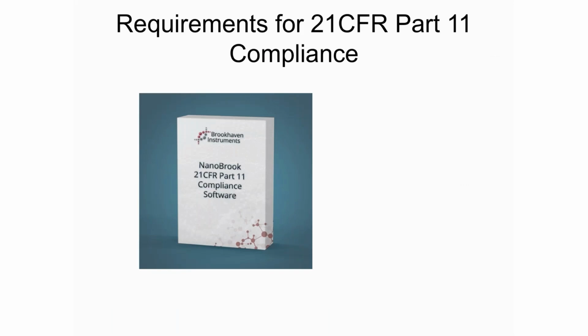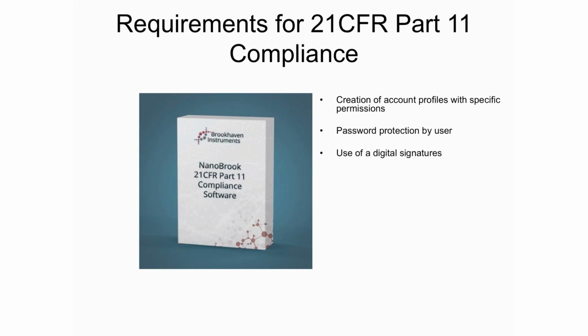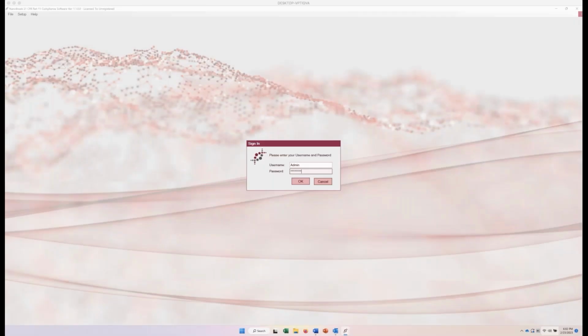What are the requirements for 21 CFR Part 11 compliance? Creation of account profiles with specific permissions, password protection by users, use of digital signatures, activity log for all events. Well, let's take a closer look at the 21 CFR Part 11 compliance software. We're going to log in as an administrator.